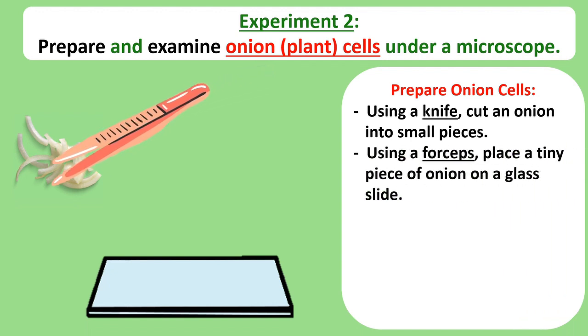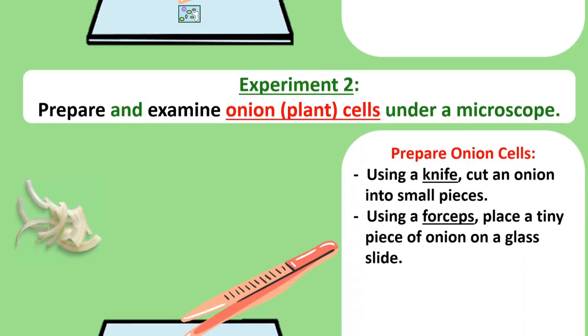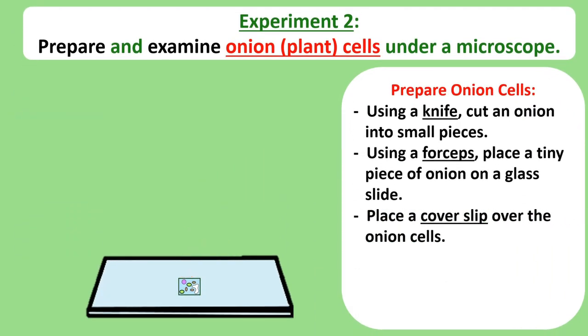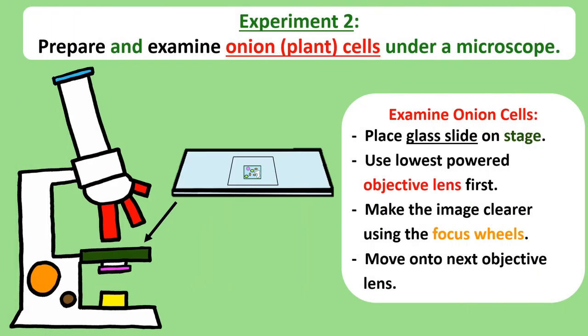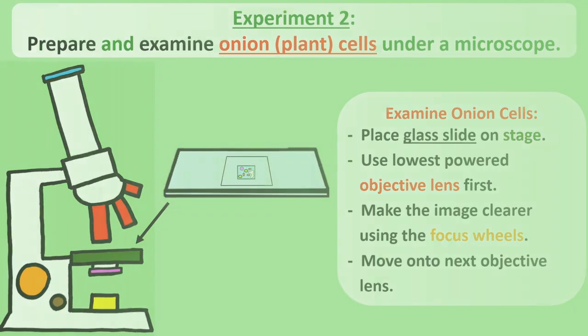Using a forceps, place a paper thin piece of onion tissue onto the glass slide. Once again, cover the onion cells with a cover slip. And instead of methylene blue, we add iodine to plant cells so that they appear more clearly under the microscope. Examine the cells the exact same way that we examined the animal cells. Just make sure that you use the lowest power objective lens before moving your way up to the higher powered lens.